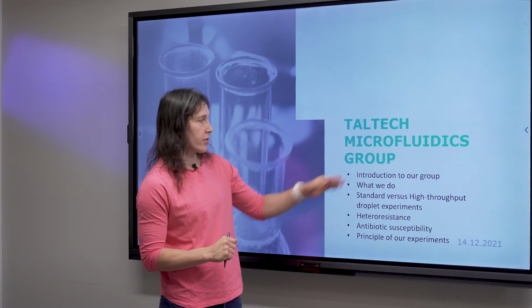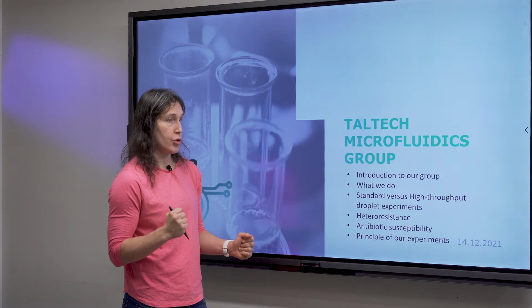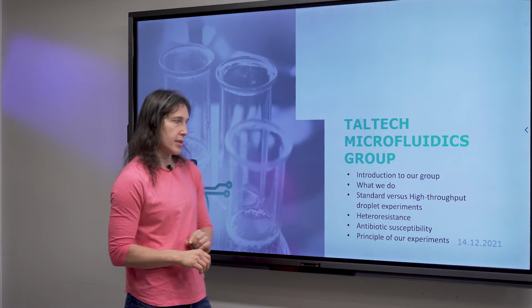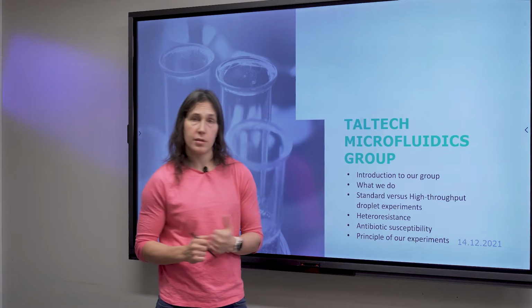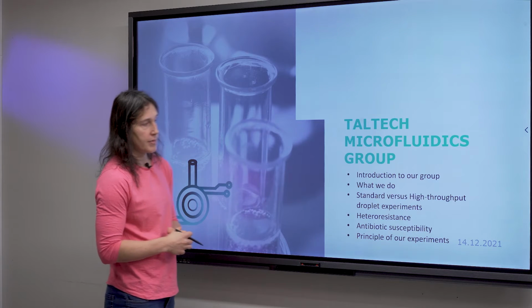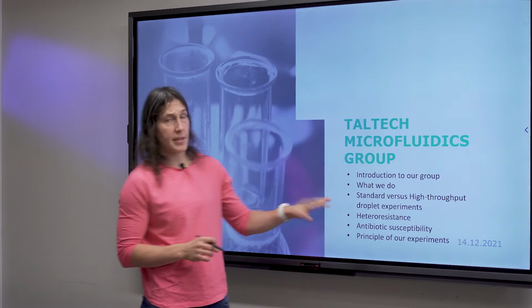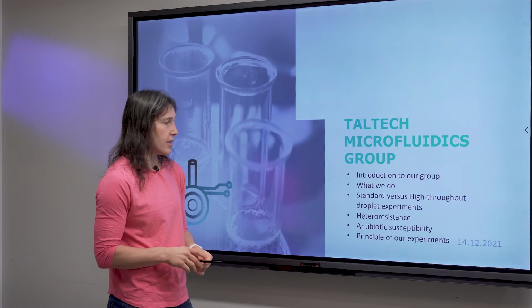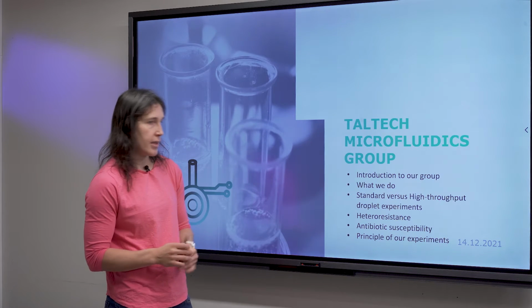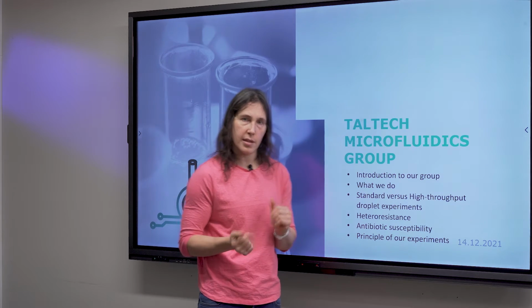What I will go through is: first introduce you to our group and tell you what we do here, talk a little bit about standard versus high throughput droplet experiments, which is important, something about hetero resistance, and I'll explain more about that, a little bit about antibiotic susceptibility, and just shortly what is the actual principle of our experiments.